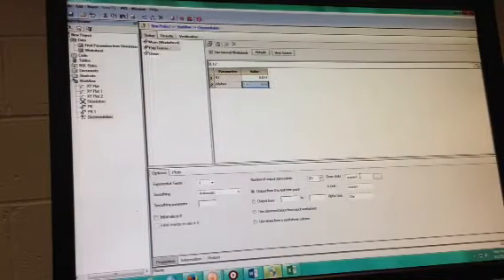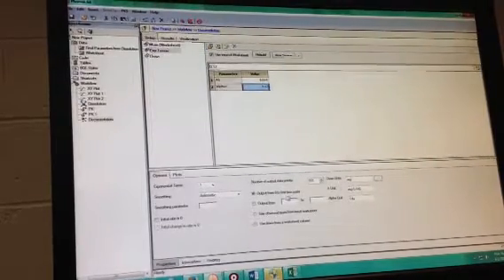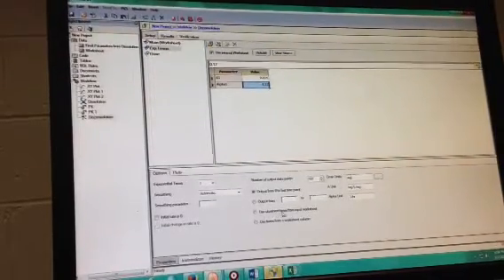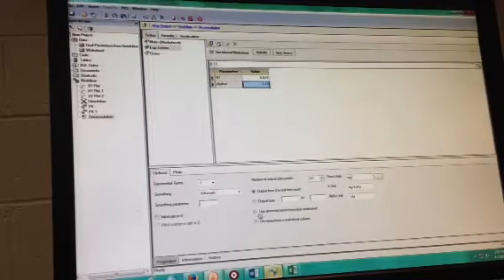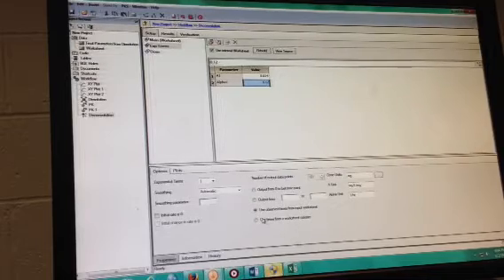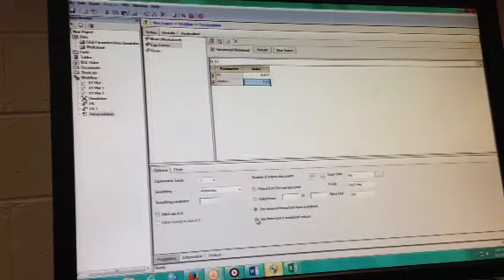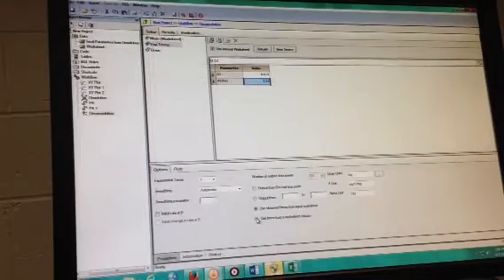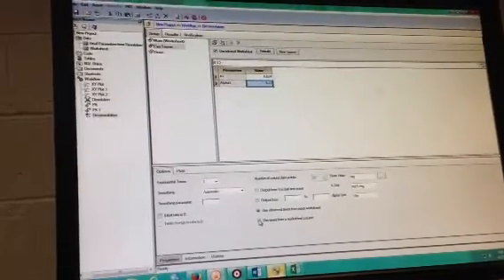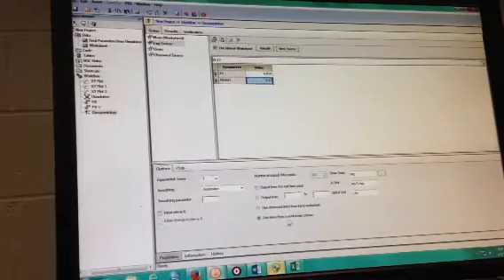The dose unit, it was in milligram, right? And then use observed time from input worksheet, let's do that. Use time, let's do from worksheet column. We can even, if we want to do the point by point with the dissolution, we can see if it lets us choose the dissolution.